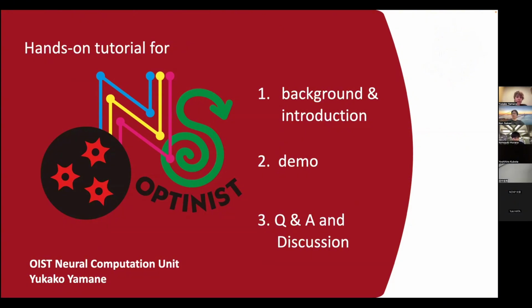The development of this framework started at the end of the last Kakushin no BrainMind 1 project. We are continuing the development under the current BrainMind 2 project. It has not been used much in practical situations yet, but we'd like to increase its practical use and gather feedback. That is very important for the developer side, to consider what kind of usability improvements and extensions are useful and necessary for future implementation.